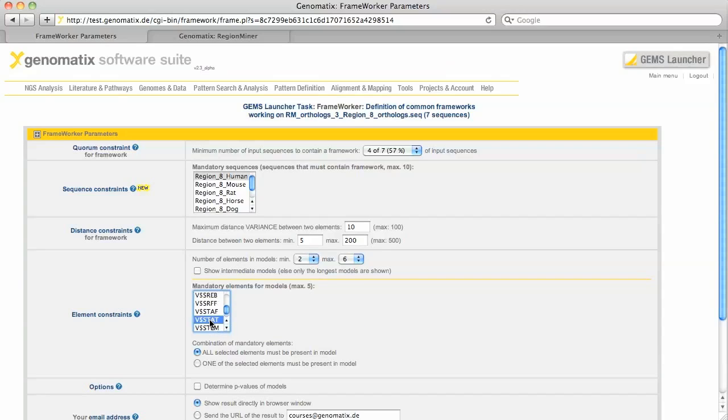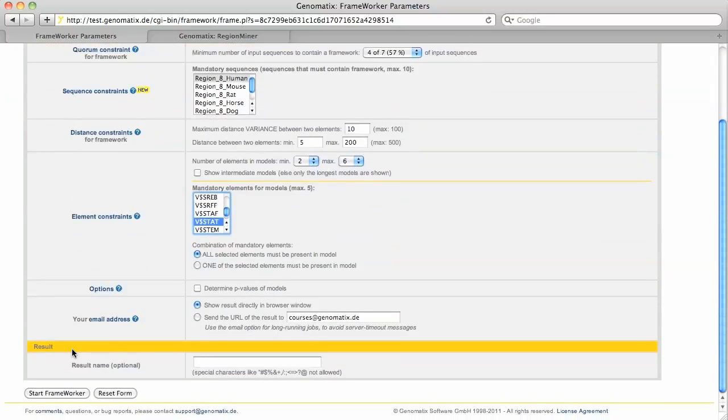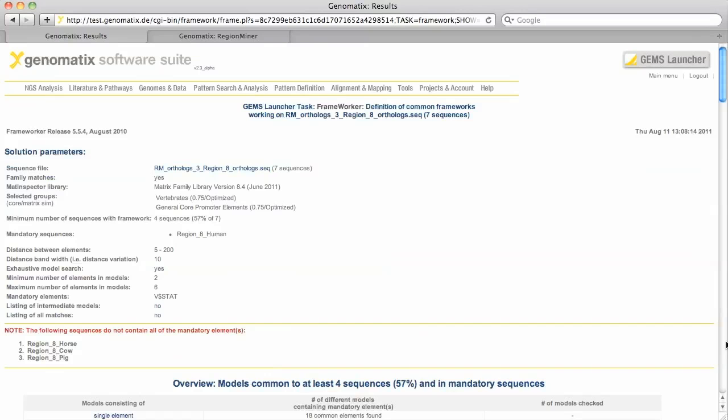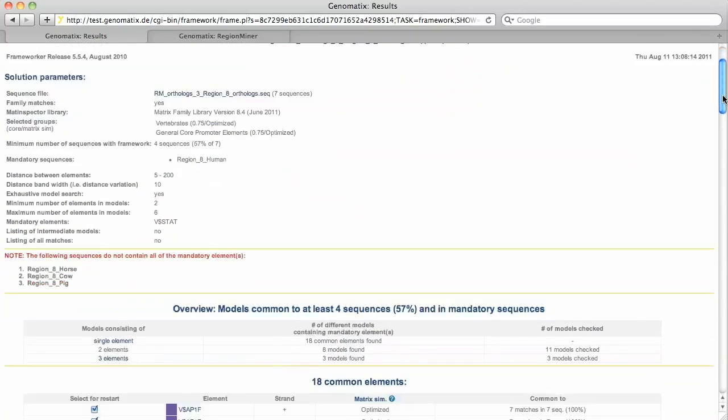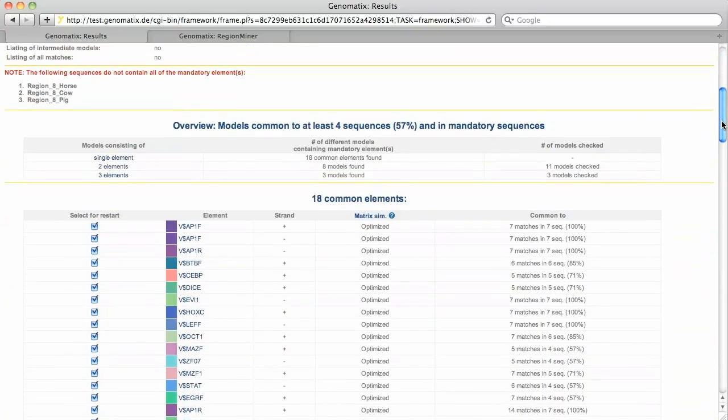Now we can start the FrameWorker. The longest common patterns we find consist of three binding sites. We have three different models with this number of elements.